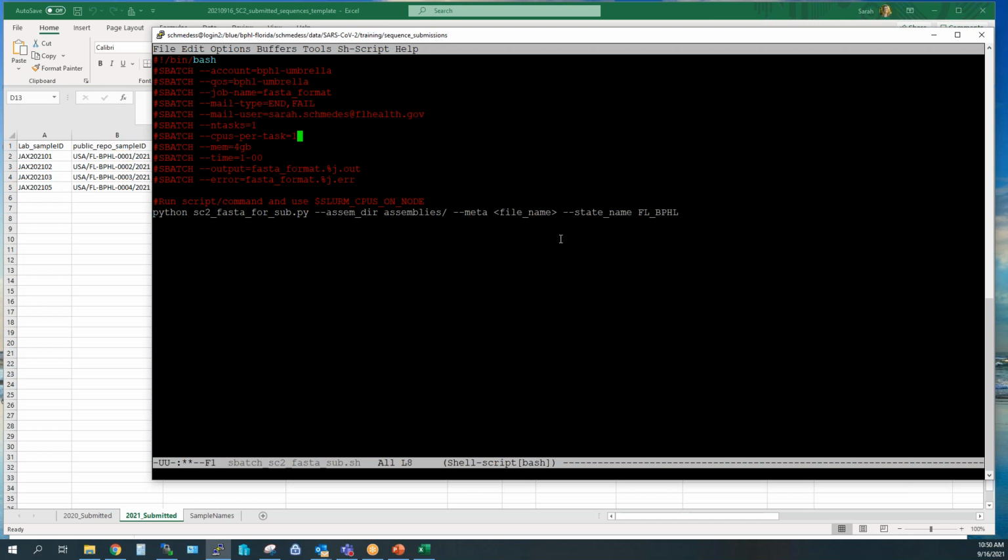You can initiate an interactive job and just run this script in real time because it doesn't take that long. If you know how to do that, or I can show you in one of our trainings. Otherwise, you can use the SBATCH script and submit it as a job. If you have a handful of samples, it literally takes seconds to run. If you have several hundred or 1,000 samples, it'll probably take several minutes, but still it's really fast.